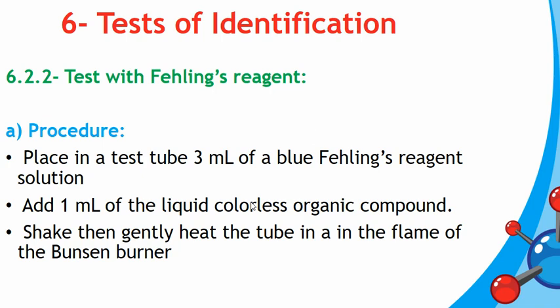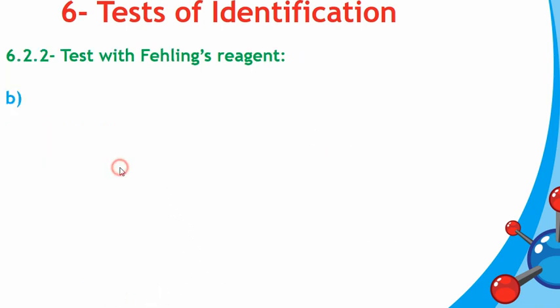The oxidant in case of Fehling reagent is Cu2+. Cu2+ is the oxidizing agent. It is reduced into Cu+, which is a brick red precipitate, brick red color, sorry. Then Cu2+ is transformed to Cu2O, which is a brick red precipitate, observed in case of aldehyde.